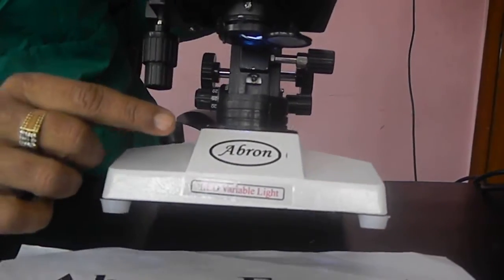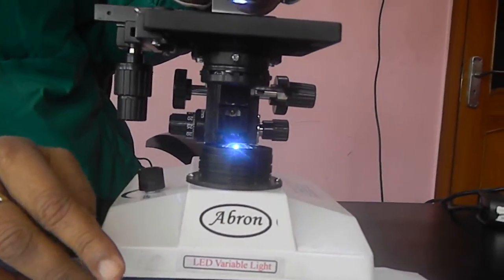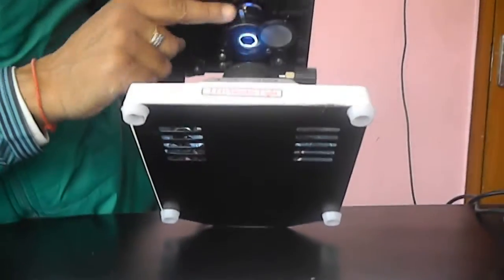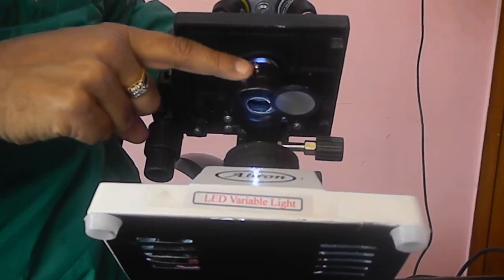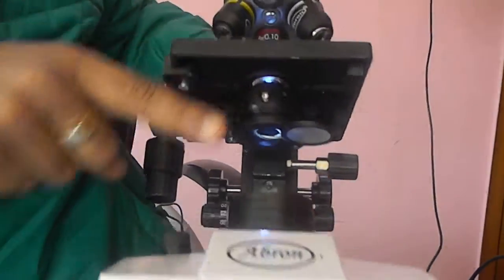It is only for dimming the light and intensity. Then there is one iris diaphragm. Here you can see this closes and opens. You have to keep it just in the middle for the start.